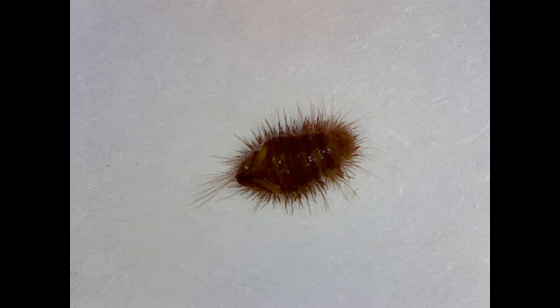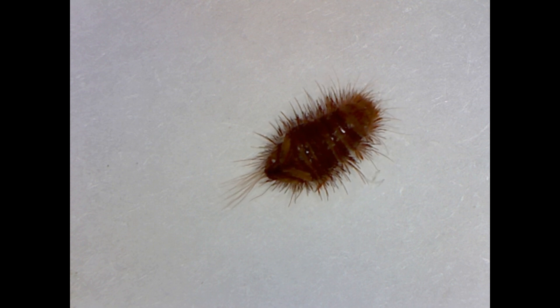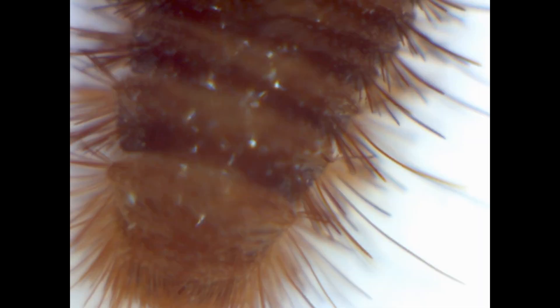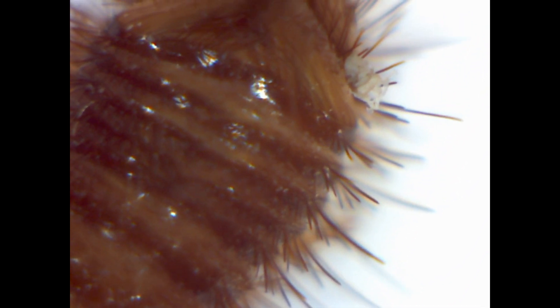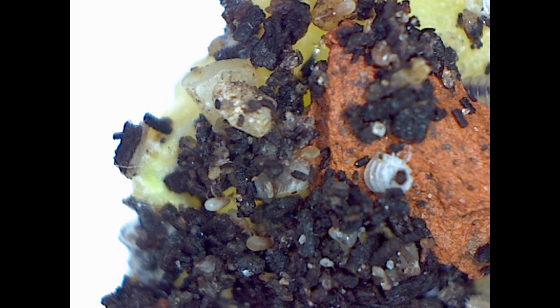Video quality is also not the best. Here you can see carpet beetle larvae with 10 times magnification, and with 150 times magnification. Here are some soil mites — again at 10 times magnification, and at 150 times magnification.